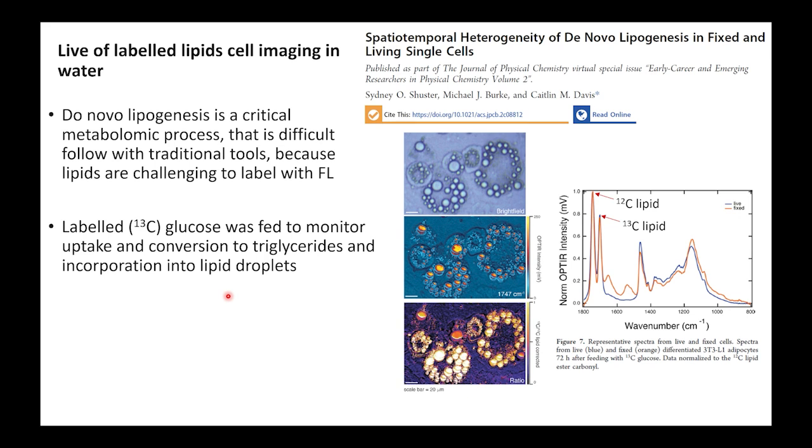So started off with C12 labeled lipid, but with the introduction of the C13, this added peak, which is shifted because it's now a heavier molecule, a heavier atom vibration. So the progression of that ratio between these two bands over time is a measure of rate of metabolism.